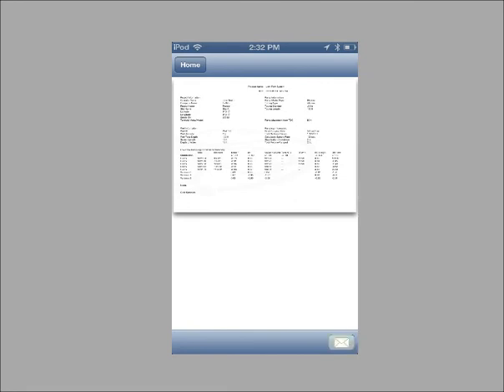Tap the envelope icon to email the results to your office. You can also find the data in the data section of the iSitu app, and you can transfer the files through iTunes.